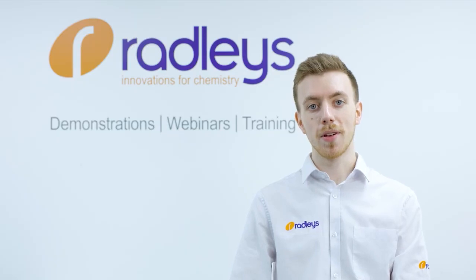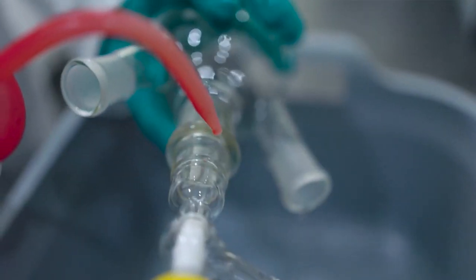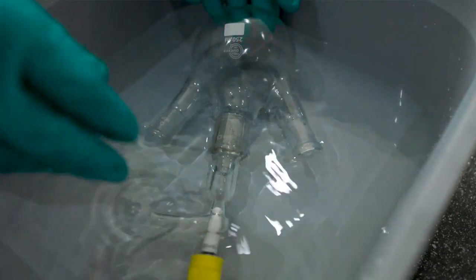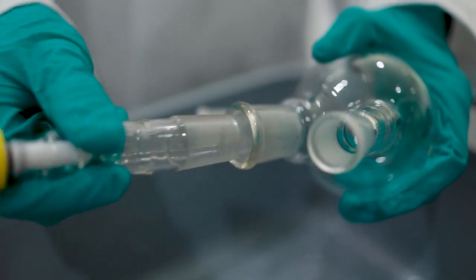Remember that glass — even the high quality borosilicate glass 3.3 that we use here at Radley's — is relatively fragile. Another method to separate the joint is soaking. This option is available only if you can empty your glassware of chemicals before you attempt to separate the joint. You can use a suitable solvent to dissolve any chemical residue in the joint, even soaking overnight if necessary, or using a sonicator or ultrasonic cleaner.